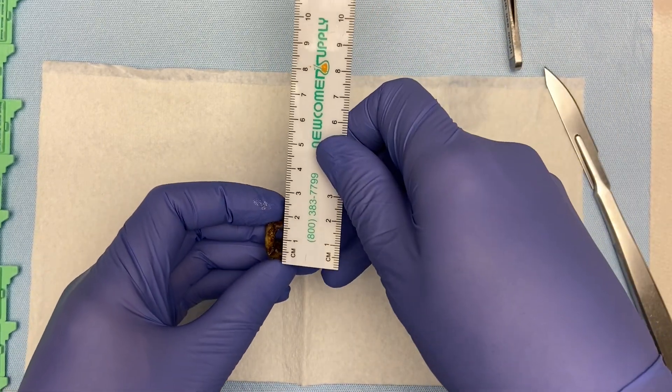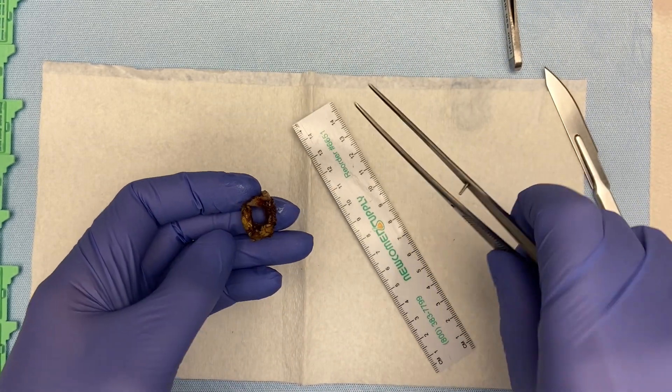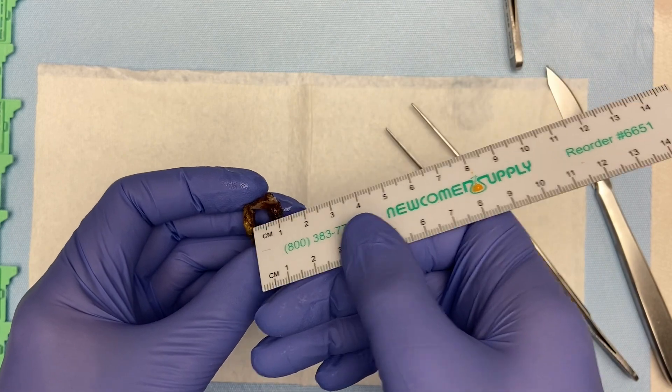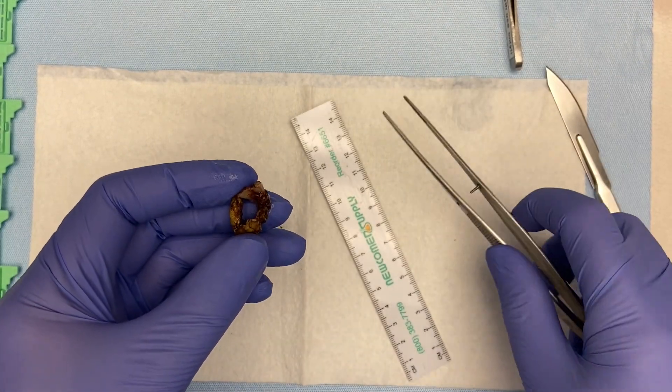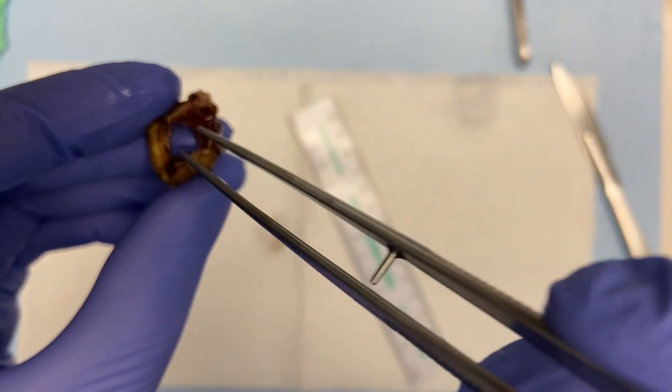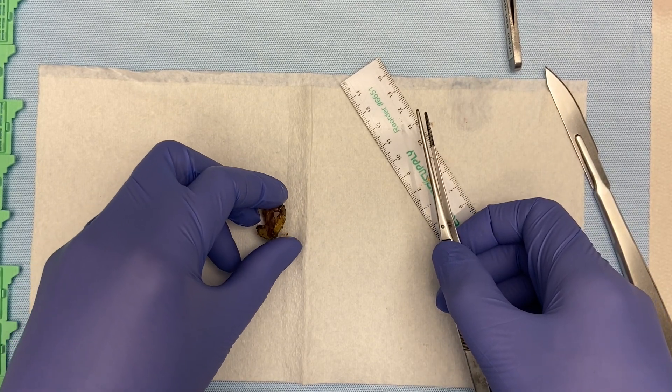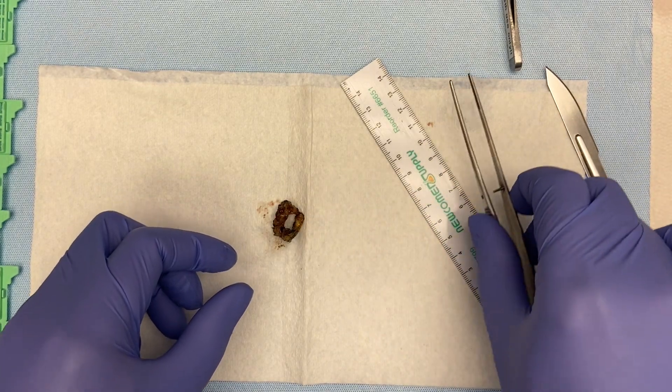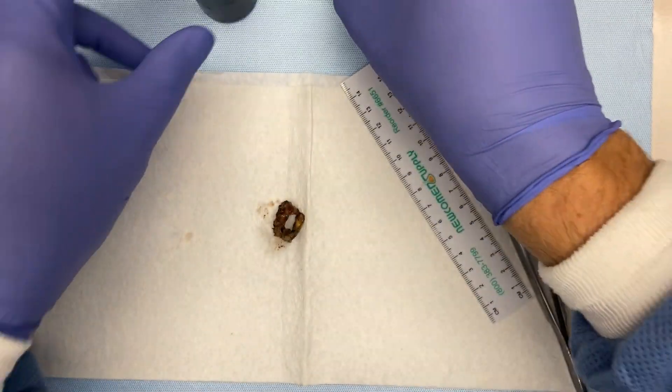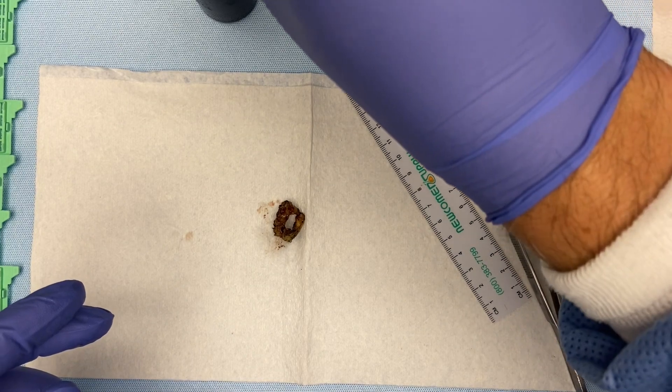This specimen is a 1.8 by 1.6 by 0.7 cm tan pink to brown annular soft tissue displaying a 1.0 by 0.7 cm central patent os. The specimen is partially surfaced by a tan pink, smooth glistening mucosa. The specimen is unoriented. The specimen is inked blue along the endocervical aspect, black along the ectocervical aspect and serially sectioned in a clockwise manner. The specimen is submitted in its entirety sequentially, in cassettes A1 through A12.